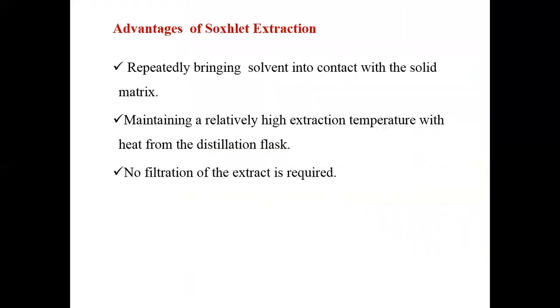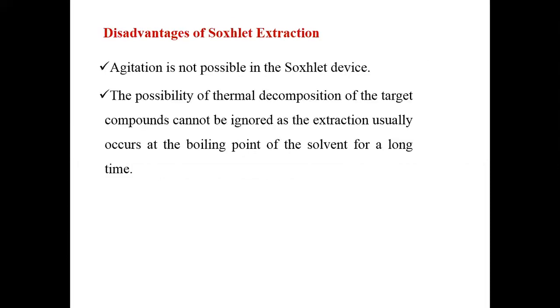What are the advantages of Soxhlet extraction? Repeatedly bringing the solvent into contact with the solid matrix, maintaining a relatively high extraction temperature with heat from the distillation flask, and no filtration of extract is required. What are the disadvantages of Soxhlet extraction? Agitation is not possible in the Soxhlet device. The possibility of thermal decomposition of the target compounds cannot be ignored, as the extraction usually occurs at the boiling point of the solvent for a long time.